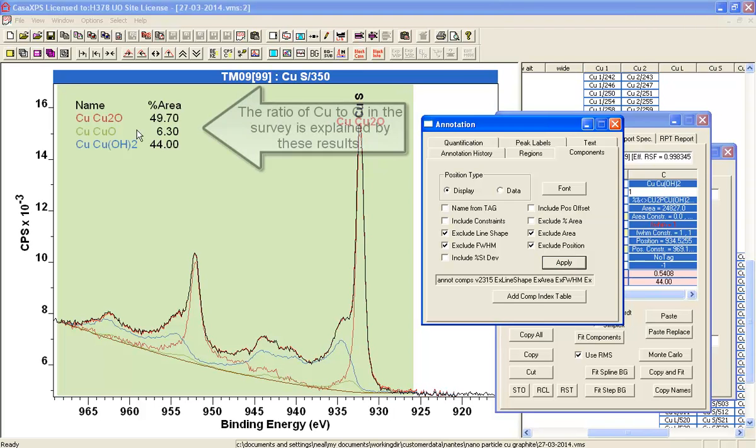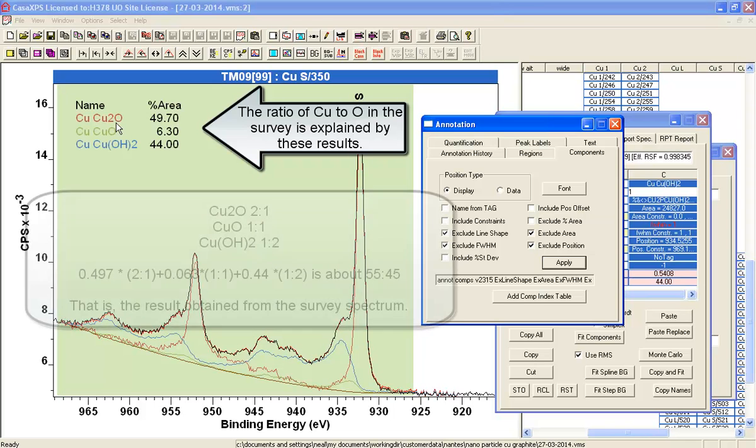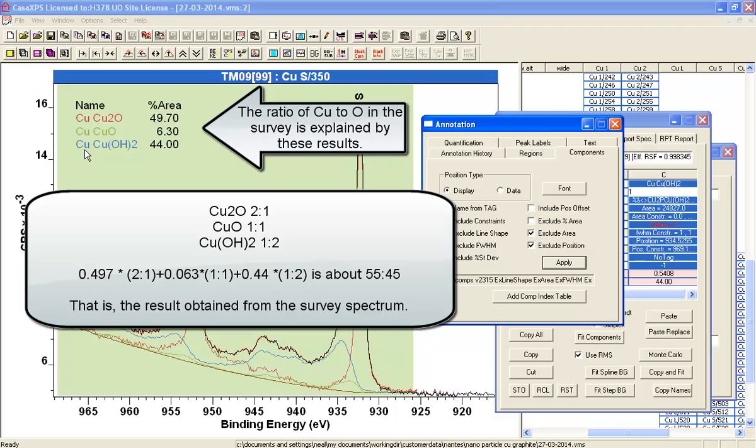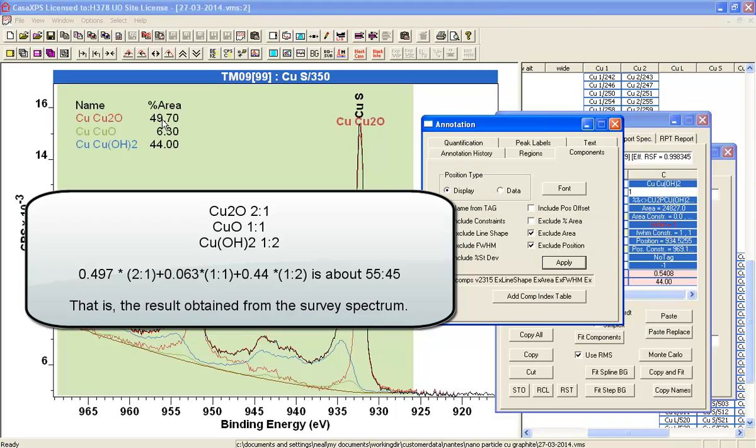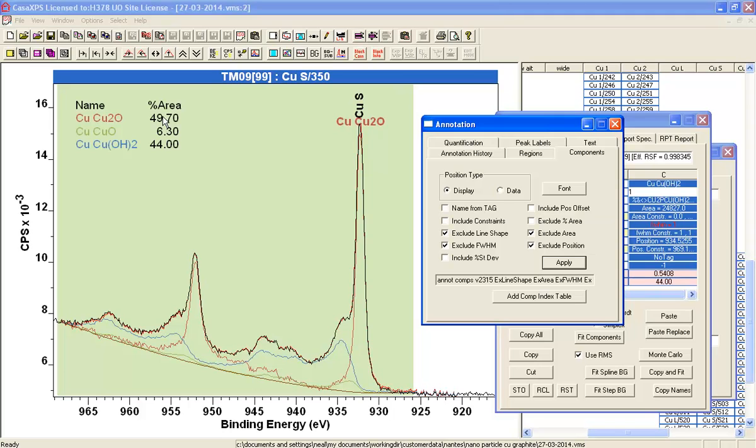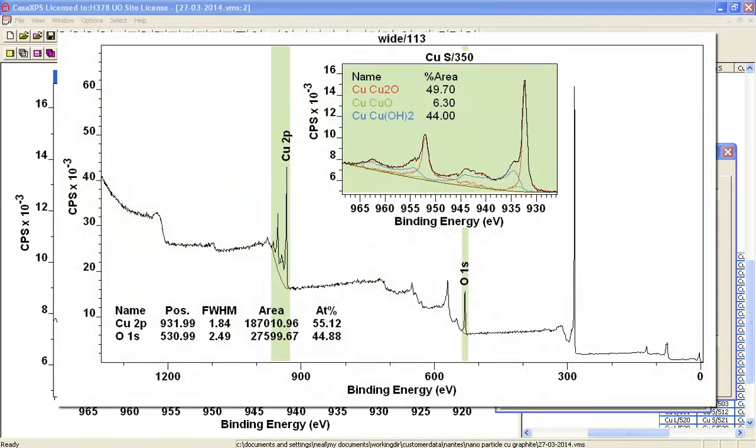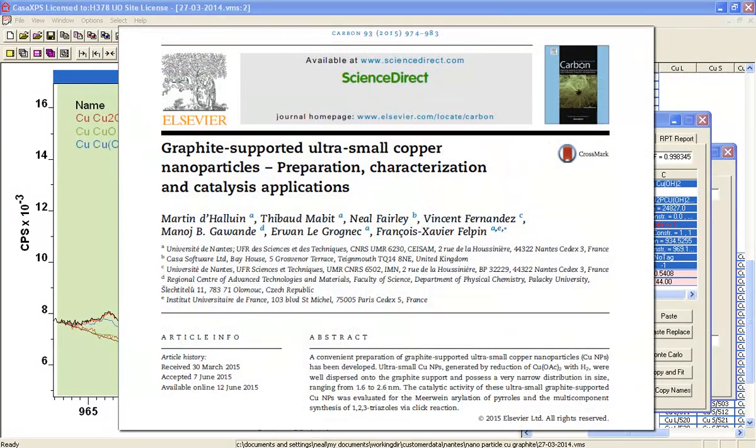So you can now see that the annotation table is showing us that we've got Cu2O, and we've also got hydroxide, and they're close in their amount. And we've also got this 2 plus, so this should be 1 to 1 for oxygen. But the fact that we've got Cu2, so we've got 2 copper to 1 oxygen, and then here we've got 2 oxygen to 1 copper, and hence these two are canceling each other out, so we get about the same amount of copper to oxygen as you saw in the survey spectrum. Hence you had to do the peak fit to really understand the oxidation states and the materials that might make up this particular sample.